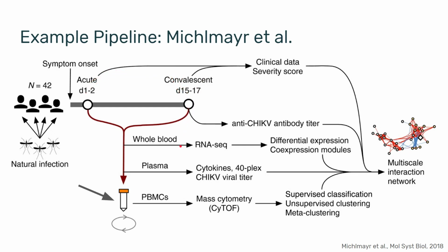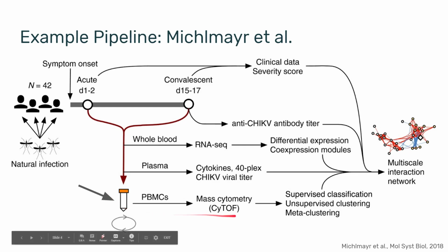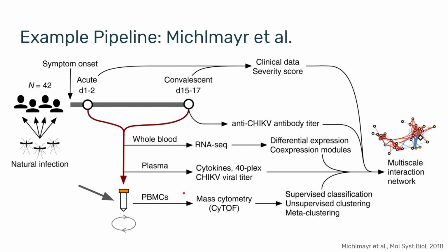The study included different assays, and I'm going to focus on the high complexity cytometry one down here, where they've taken the PBMCs and used, I think, a 33 panel mass cytometry experiment to acquire them. So they got the data, and then what have they done with it?